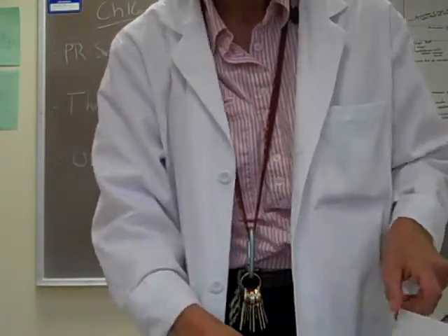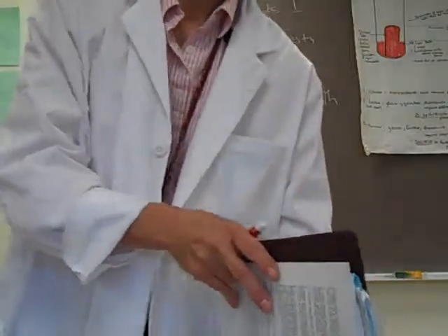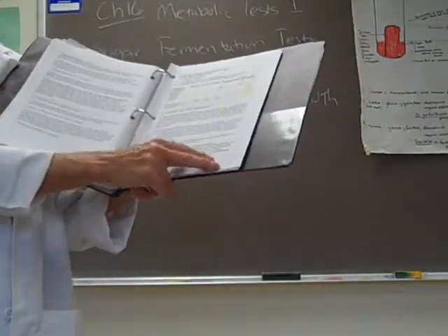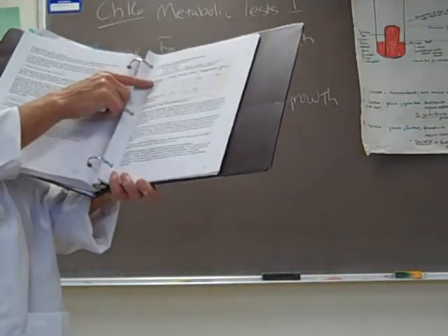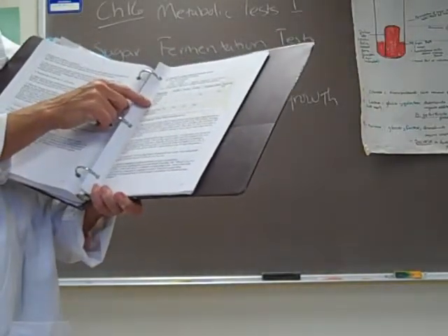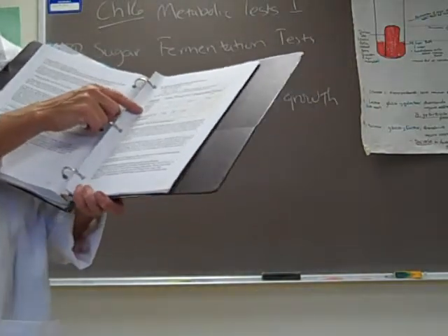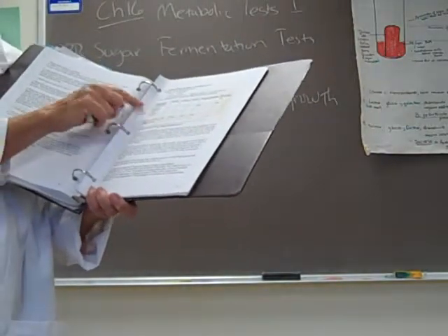So as always, you guys, make sure that you're reading the introduction and reading the text of the lab. Okay, so what we'll first do is talk about the Phenol Red sugar fermentation tests. And what I'm going to do is refer you to page 142. There's a little table there that will help guide us to know which sugar fermentation media we'll use with our different bacteria.